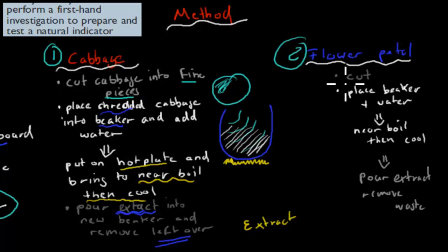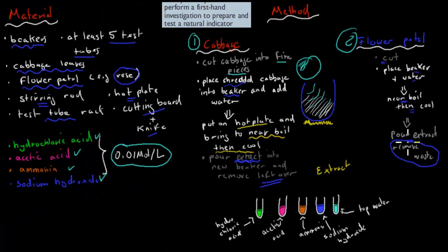We do exactly the same thing for the flower petals. First, cut the flowers into smaller bits. Then place the flowers in a beaker and add some water, just like we did with the other one. Then we bring it to that near boil and let it cool afterwards. Once we've done that, we remove the solution, which is what we want. That's our indicator. We remove the solution and put that into a new beaker. Now we have two extracts: the cabbage indicator and the petal indicator.